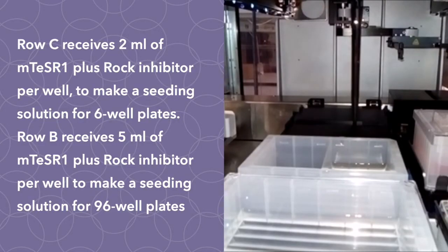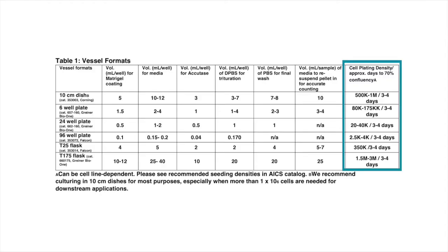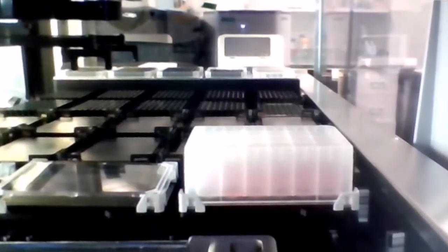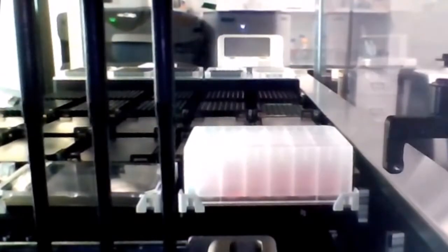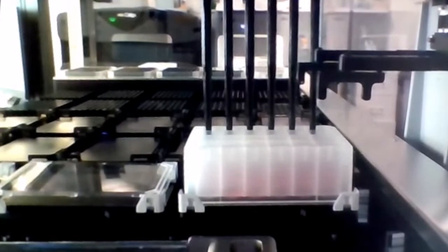As manual counting occurs, row C of the microplate is prepared with two milliliters of mTeSR1 plus rock inhibitor per well, while row B receives five milliliters. The operator uses the manually collected cell count to determine the amount of cell resuspension to add to rows C and B to achieve the desired seeding concentration. The operator enters the correct volumes — first for the six-well plates, then for the 96-well plates. Row C will bring the final volume to three milliliters per well; row B will bring the final volume to six milliliters per well, enough to seed five 96-well plates.